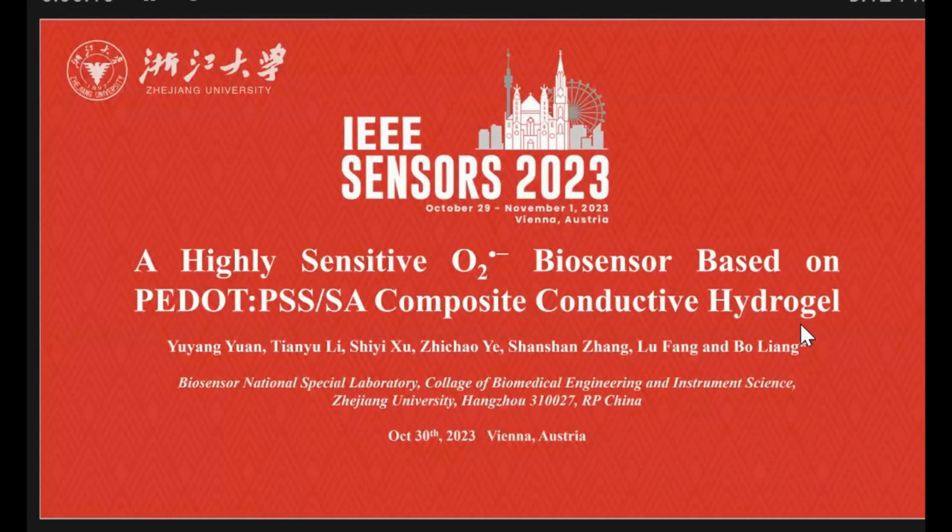I'm from Zhejiang University. My presentation today is a highly sensitive superoxide anion biosensor based on PEDOT:PSS and sodium alginate composite conductive hydrogel.